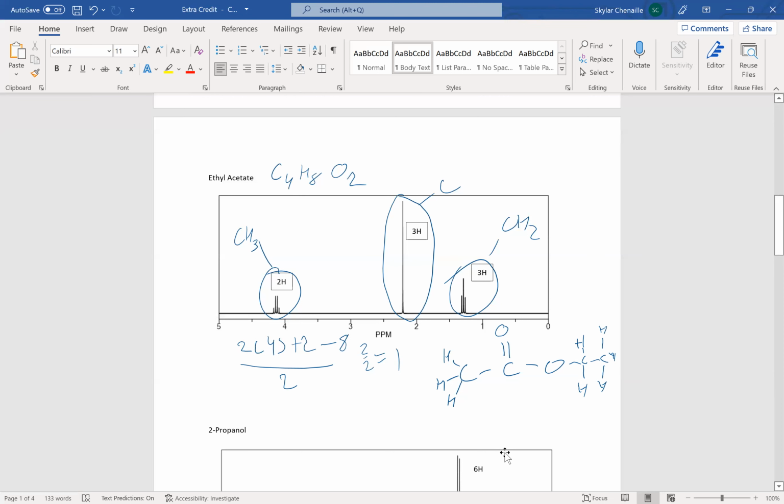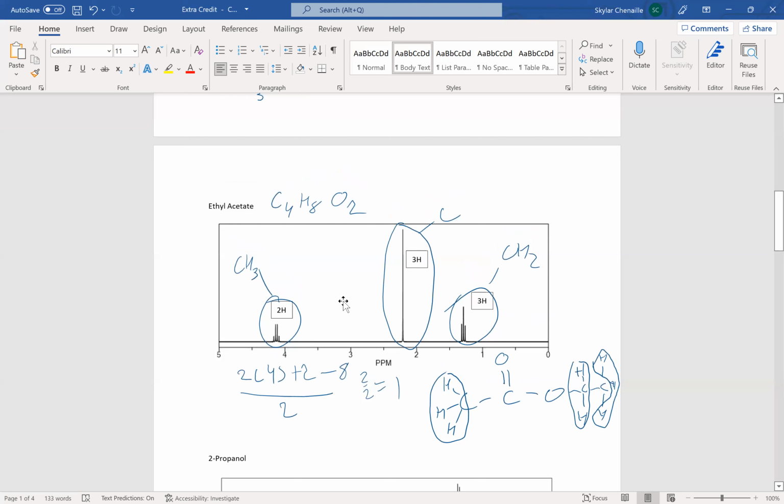Let's take a look at how many groups there are here of hydrogens. So we have this one right here, because that's to carbon, carbon is to an oxygen. This one right here, because these hydrogens are closer to this oxygen than these ones over here. So that would make this another group right here. Now let's think about, why are these ones so far over here?